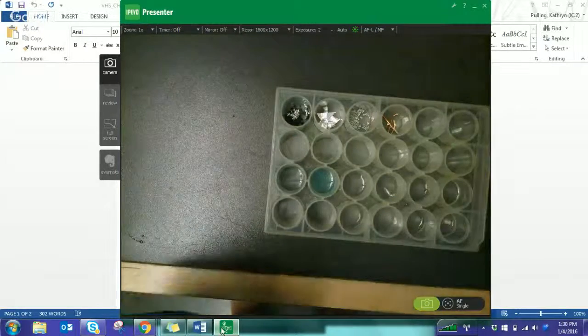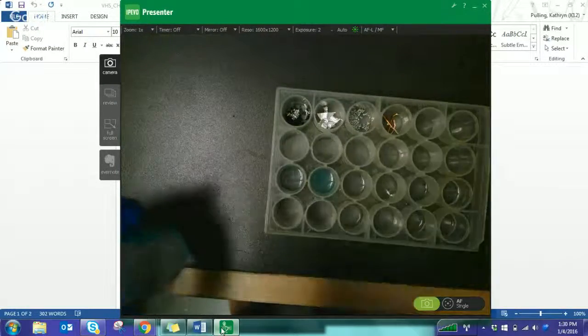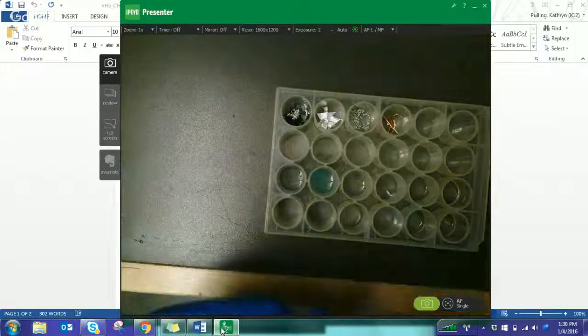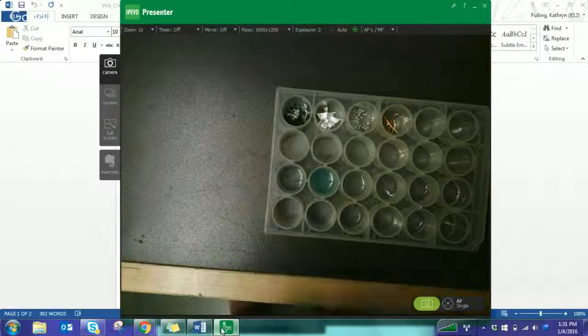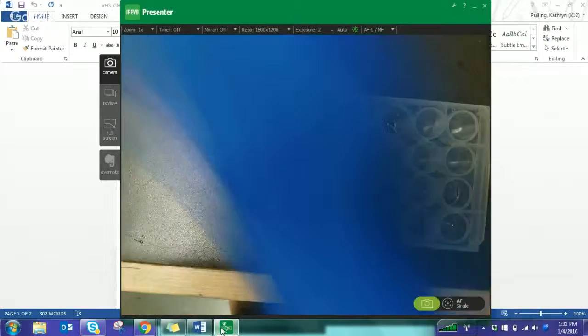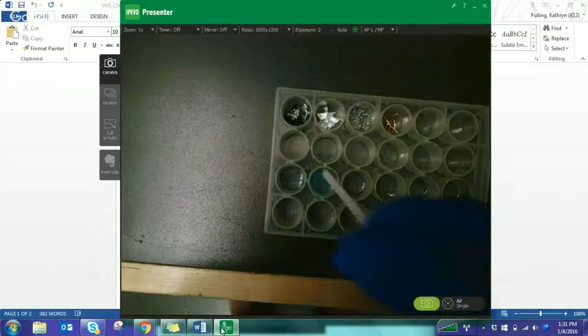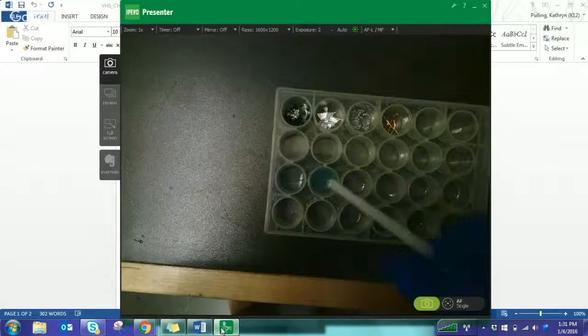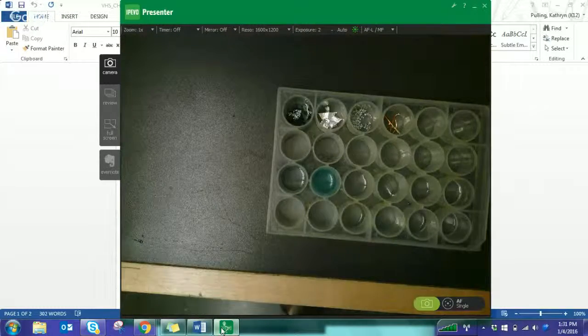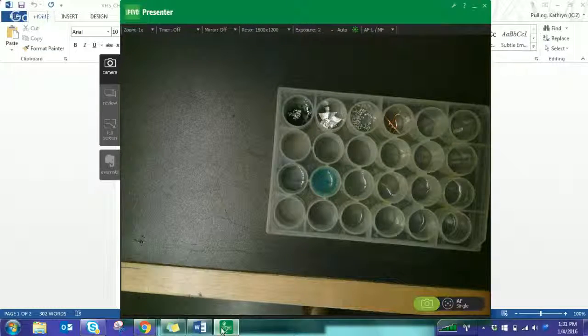So here we have something that is lighter blue getting kind of darker blue. In this one, you might be able to see that it's a solid better if you have that hand lens handy, but it actually kind of looks like this chunky blue stuff, which means a precipitate formed. So we have a reaction, which means I will leave the other four up to your excitement to find out if a reaction occurs when you do it.